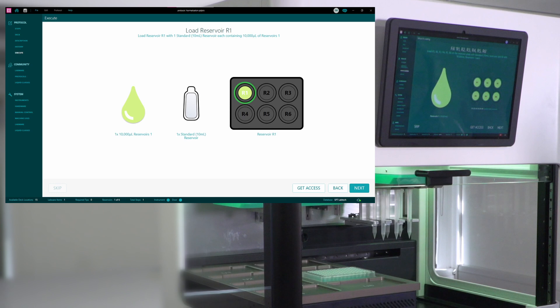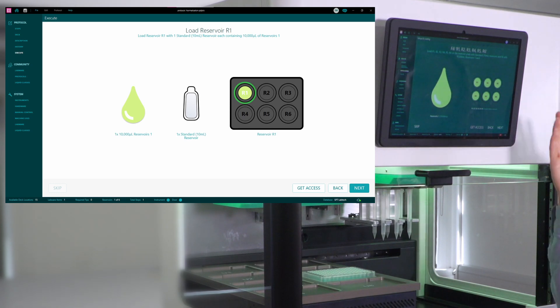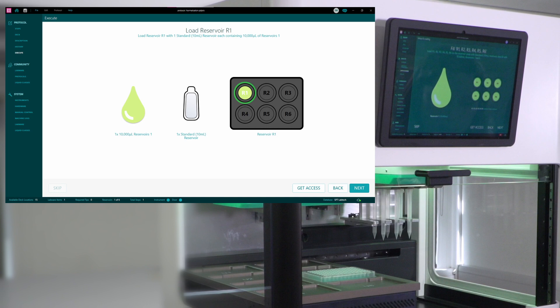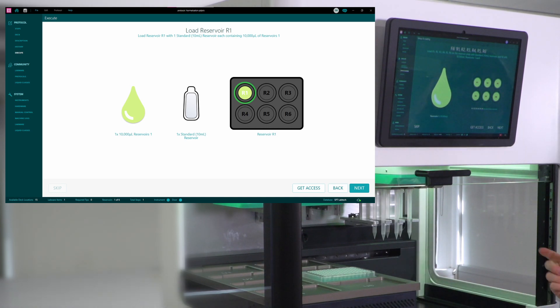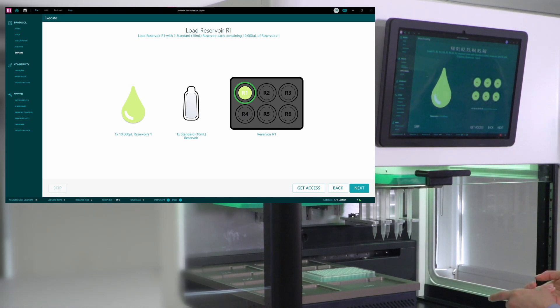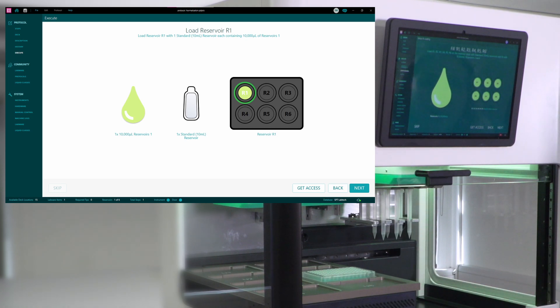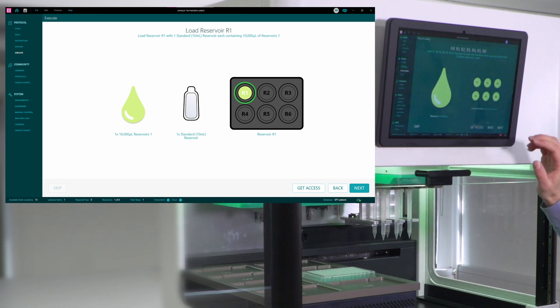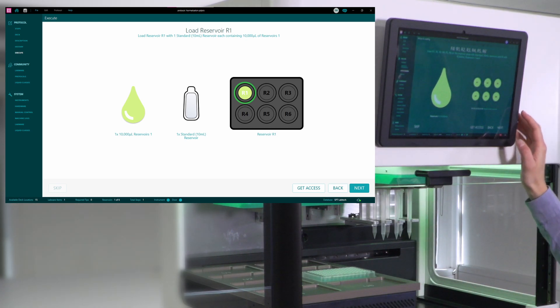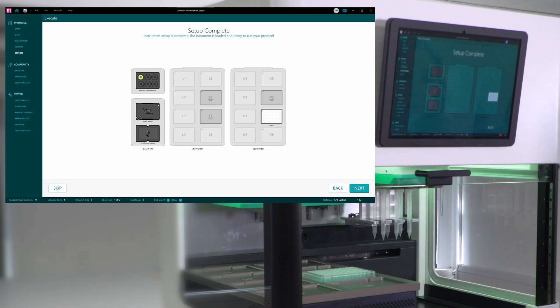So if I go next, next, this screen guides me in loading the reagents into reservoirs for the dispense head. I have already loaded them, they're present here. But in case I haven't, it will have reminded me what I need to load.